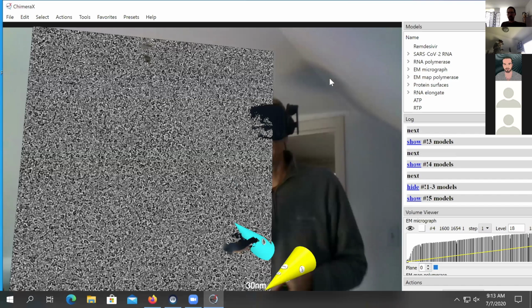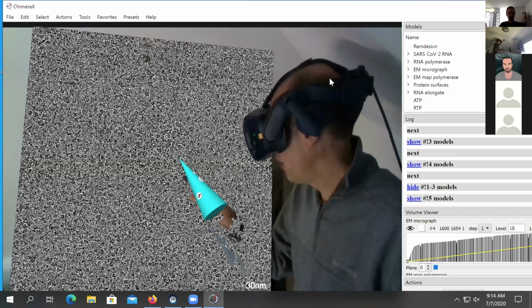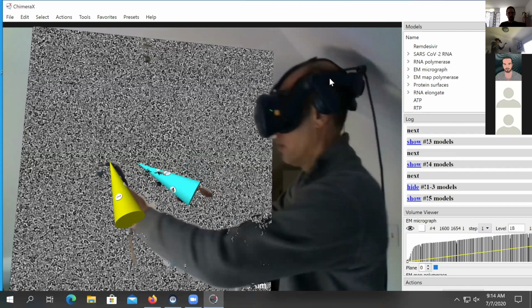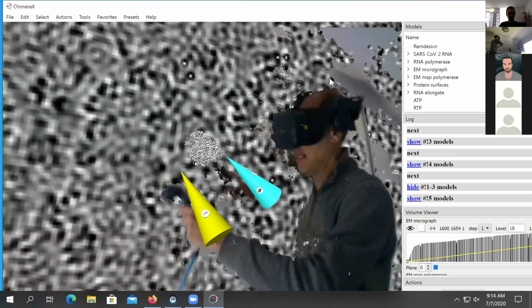Will do. Okay, excellent. So the little black specks, the little paw prints here, are the polymerase. There are about 1,000 in this micrograph. And they took 3,000 of these images, so they had a lot of particles to reconstruct and get this three-dimensional map. Like so. It's about 3 angstroms resolution.